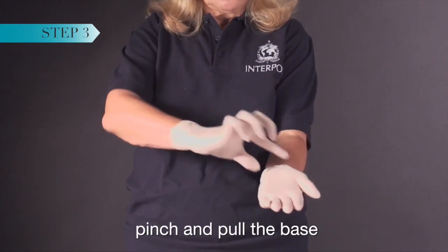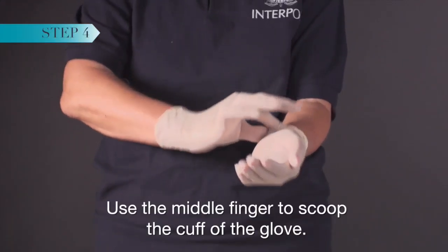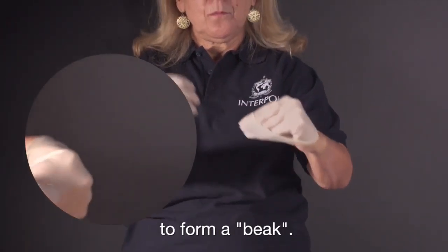Using one gloved hand, pinch and pull the base of the other gloved hand. Use the middle finger to scoop the cuff of the glove. Pull the glove inside out over all the fingers and thumb to form a beak.